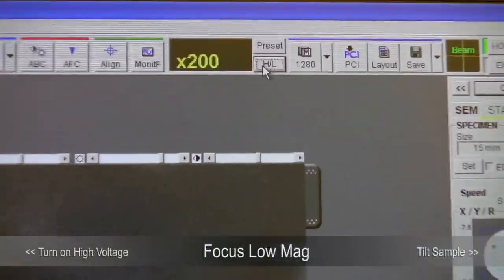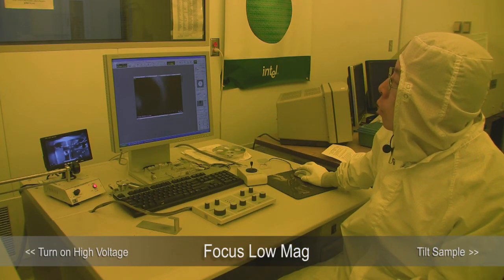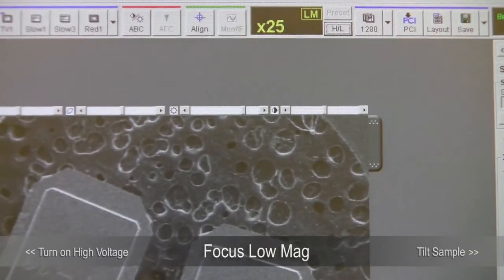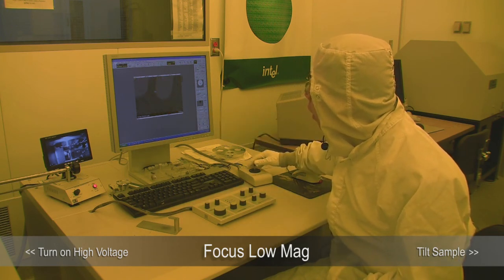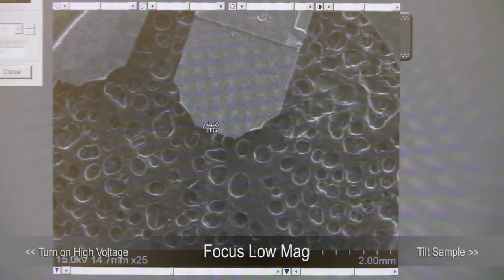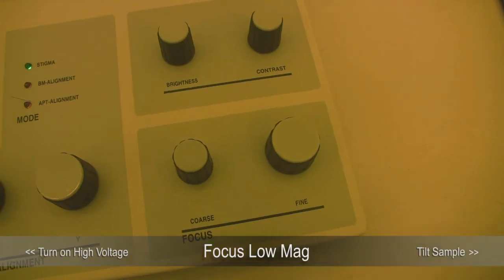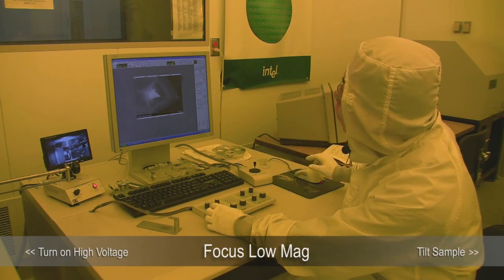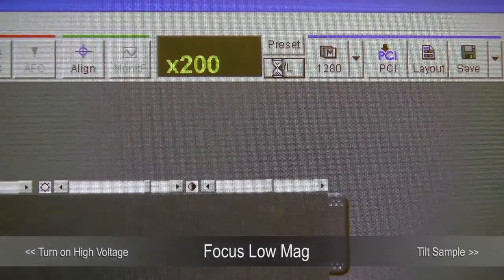The first thing we do is go to the high-low magnification button, which toggles between high and low magnification. Toggle to low magnification — that allows you to zoom out more and find your device. Shown here are two AFM tips; at the end is the AFM cantilever. To zoom in, use the magnification button. LM means low magnification. Once we zoom in, we use the coarse focus and fine focus controls. Once we find the area we want to look at, we go to high magnification — the LM indicator disappears and we enter high magnification mode.